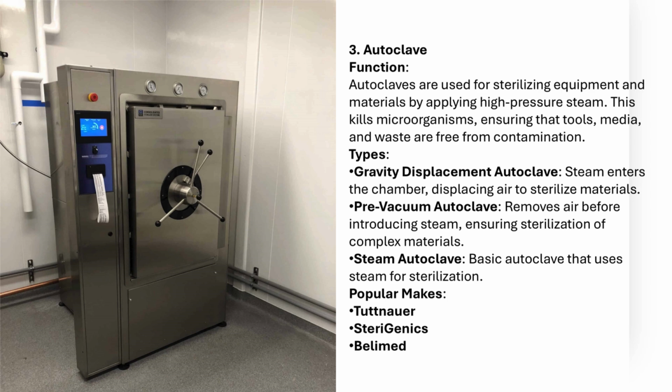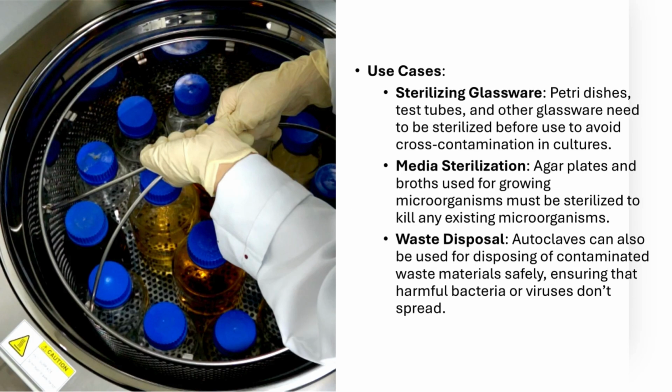Some of the top brands for autoclaves include Tuttnauer, Sterigenics, and Belimed. These brands are well regarded for producing high-quality, reliable equipment that microbiologists around the world trust for sterilization tasks. Now, let's talk about how autoclaves are used in everyday microbiology. Here are some key use cases where autoclaves are essential.